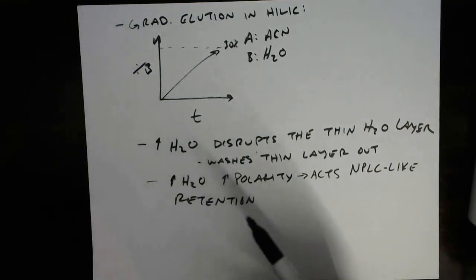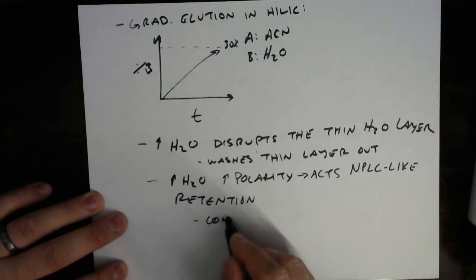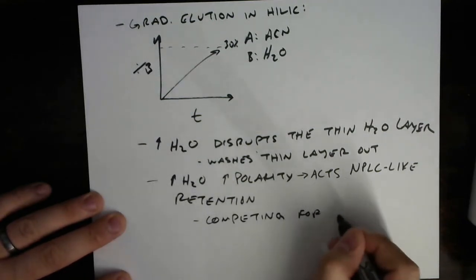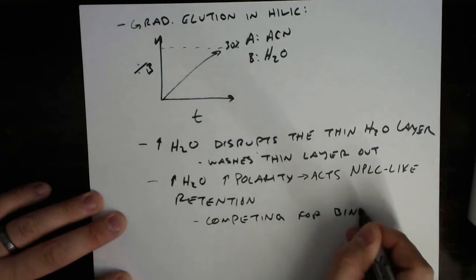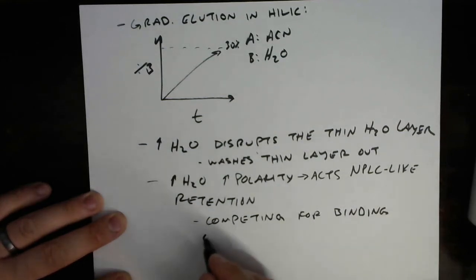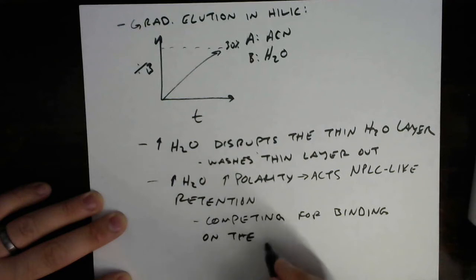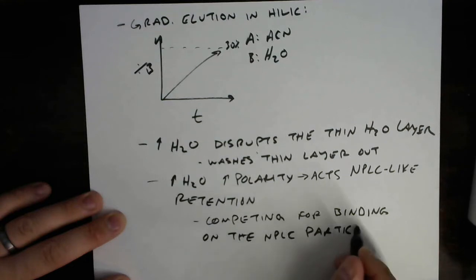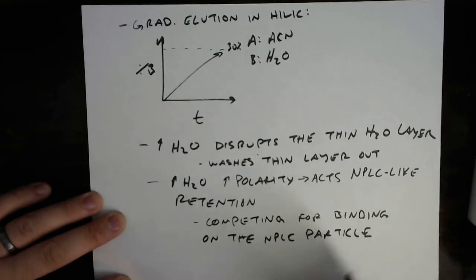You also start competing, let's say competing for, again, this word that probably isn't the right word, binding on the NPLC particle. Okay.